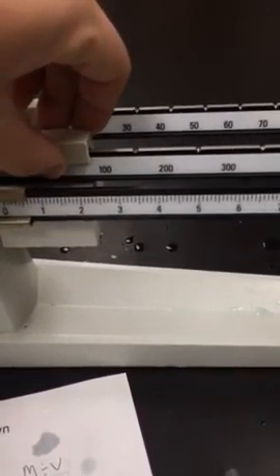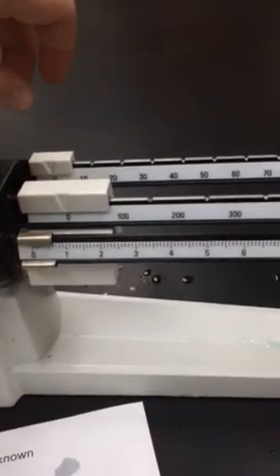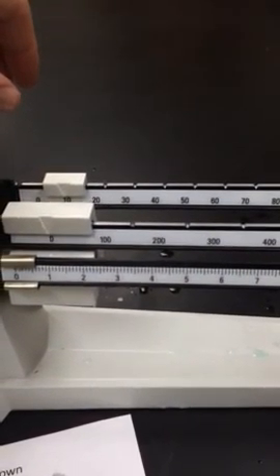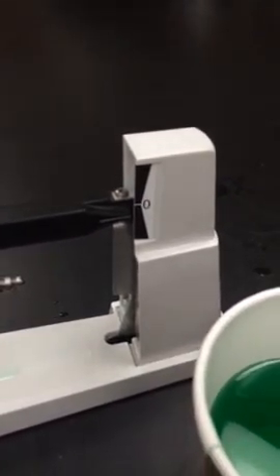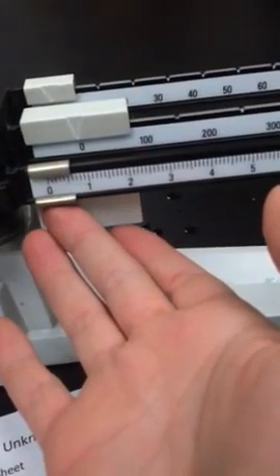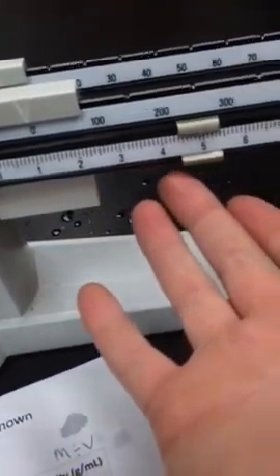We're going to start at 100s. 100, obviously too heavy. We move it back to 0. 10. Little bit too heavy. Okay, so now we're going to move 10 back to 0. And now we're just going to use our 1s. So we're going to move this over.